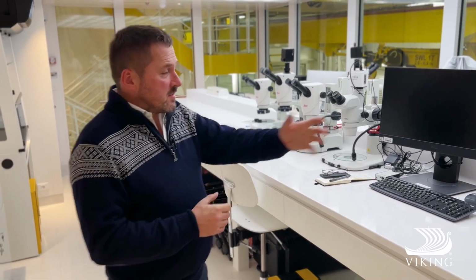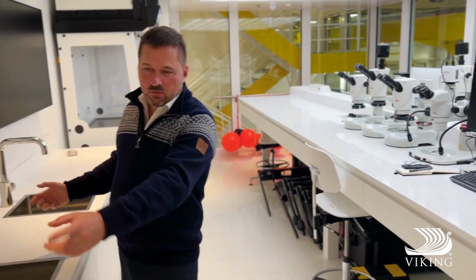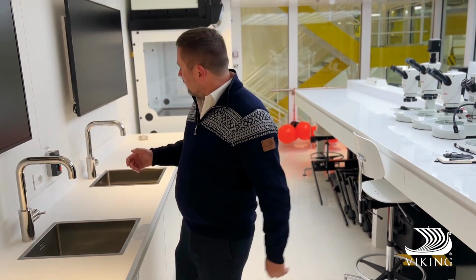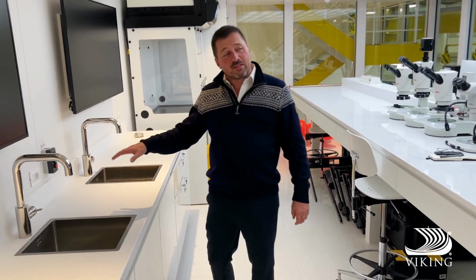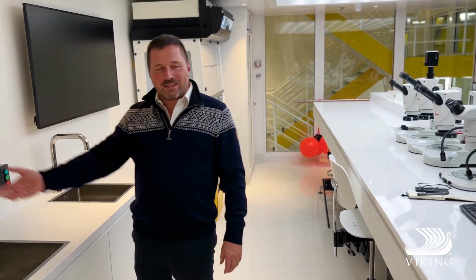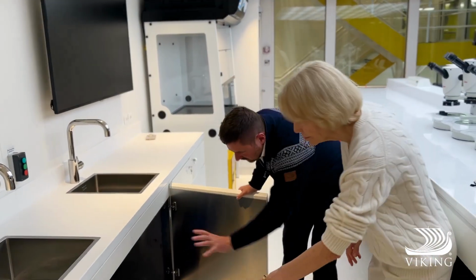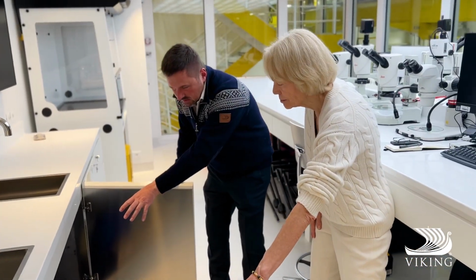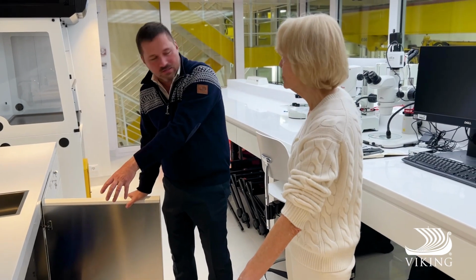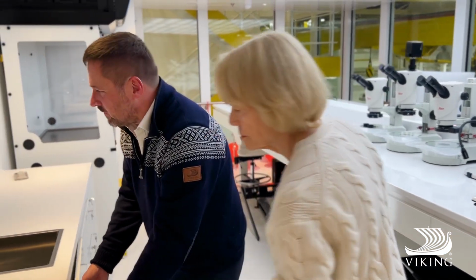So in the first instance, there is space. We have seawater and freshwater coming out of the taps. And in fact, having seawater coming at that takes a lot more work than having pipes running seawater 59 meters or about 180 feet from the clean point on the vessel. Even that is of itself challenging. In here, this is all filtration so that anything that goes in these sinks is filtered out and so that we don't put anything back in. And of course, it's kept in grey water.